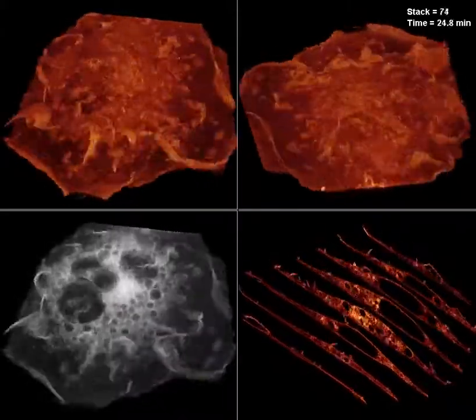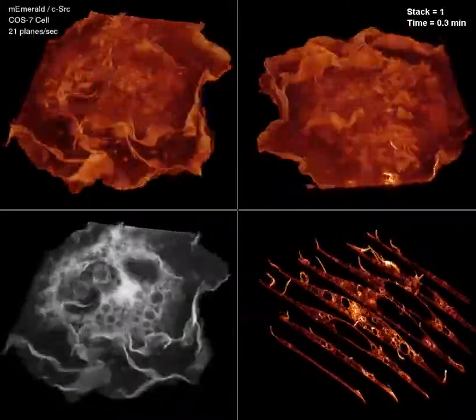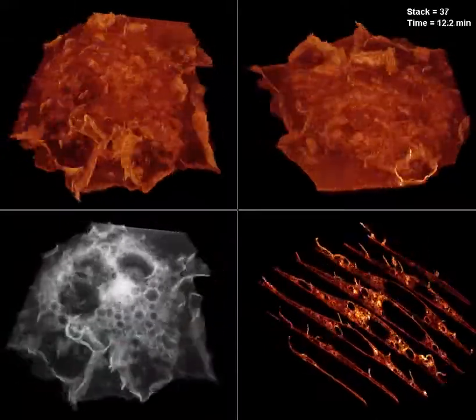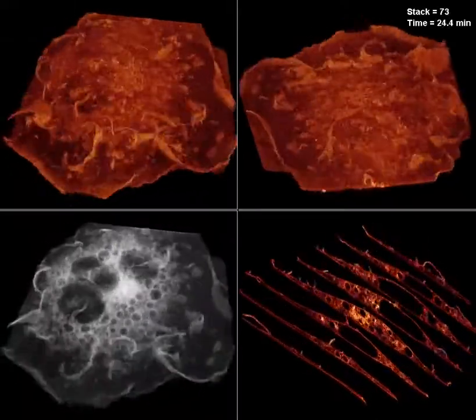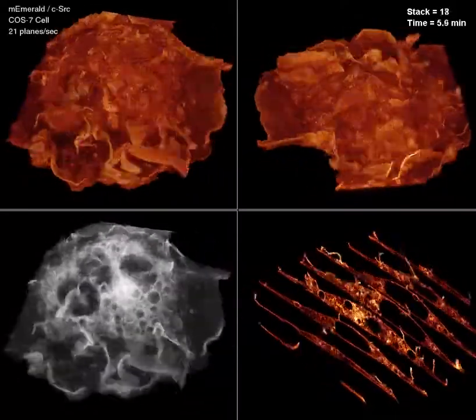In the four views you're seeing, on top are two different angles of the cell surface. Because the movie is a 4D movie of X, Y, Z, and T, we can present the data in different ways.